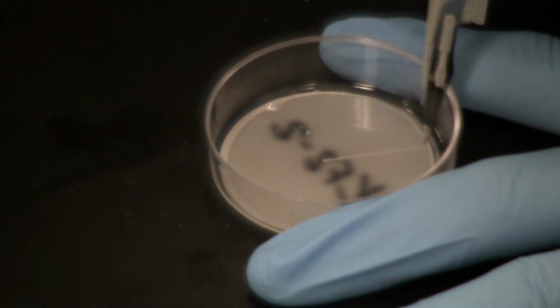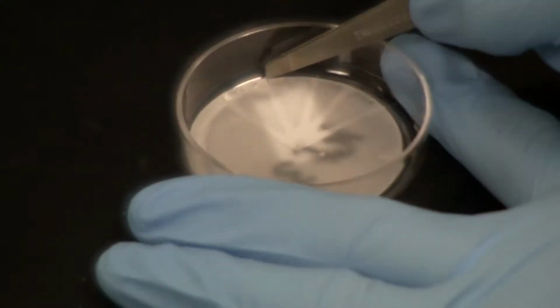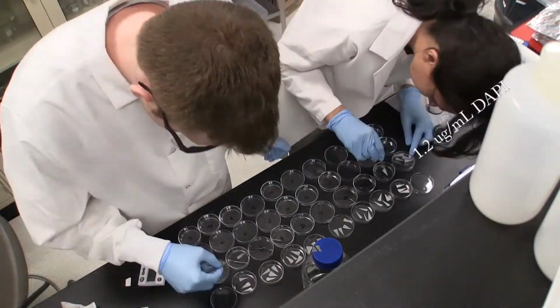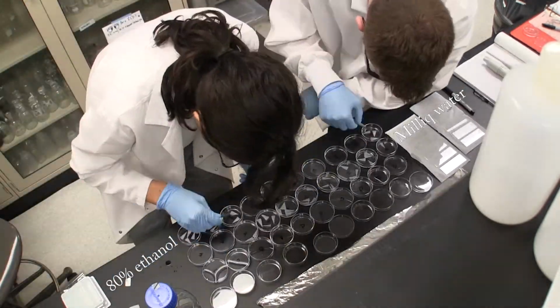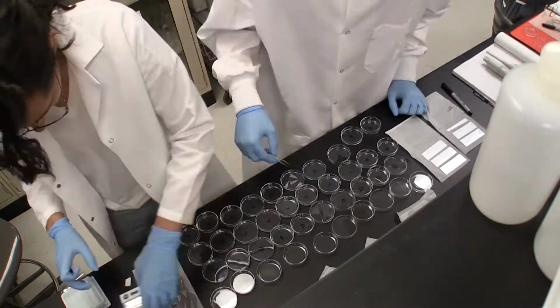The next step involves slicing up the filters and staining them using the chemical compound I mentioned earlier known as DAPI. What DAPI does is complex, or bind, with any DNA present in the sample. DAPI is also capable of passing through intact cell walls, so it can stain both live and dead cells. Once it is bound with DNA, it is capable of fluorescing under ultraviolet light. These characteristics make it a very useful tool for determining the total number of cells in the water.